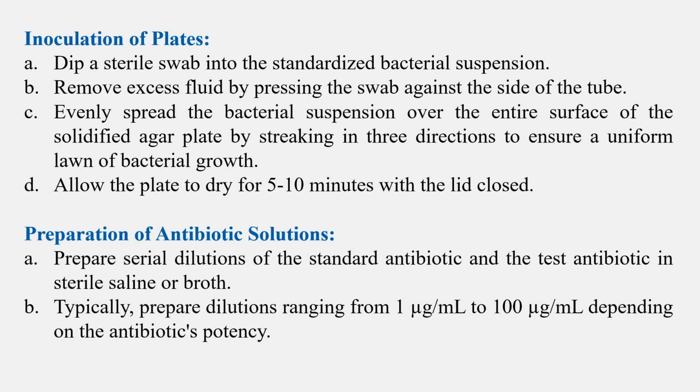Preparation of antibiotic solutions. Prepare serial dilutions of the standard antibiotic and the test antibiotic in sterile saline or broth. Typically, prepare dilutions ranging from 1 microgram per milliliter to 100 micrograms per milliliter, depending on the antibiotic's potency.